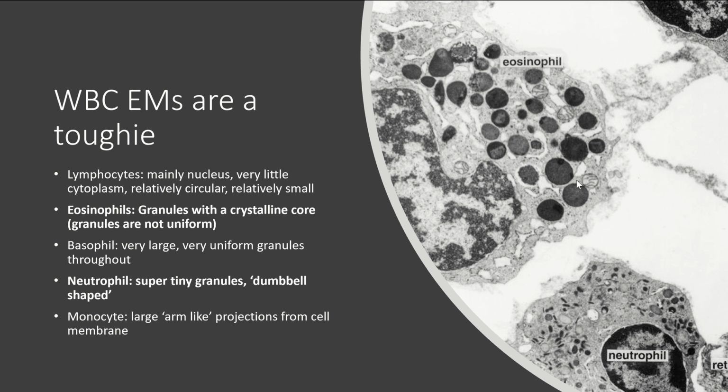So this is an eosinophil, and the way I know it's an eosinophil is that on electron microscopy, eosinophils have this thing called a crystalline core within their granules, okay? So hopefully you can appreciate this is the nucleus of that eosinophil doing whatever it feels like, and all of these are those little granules, right, that on light microscopy look red, those red granules, right?